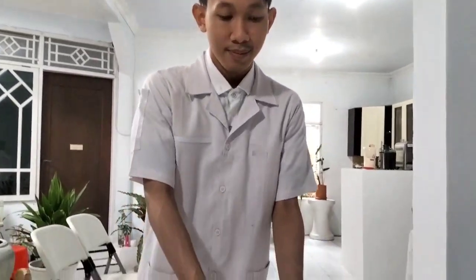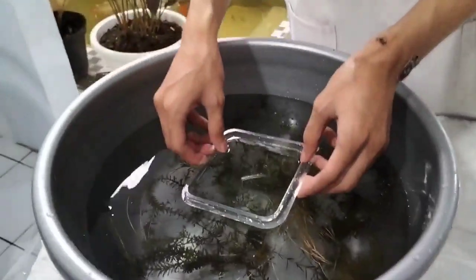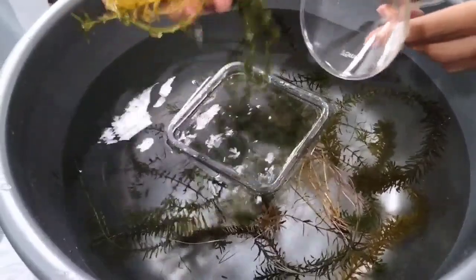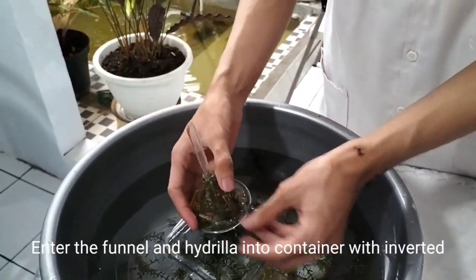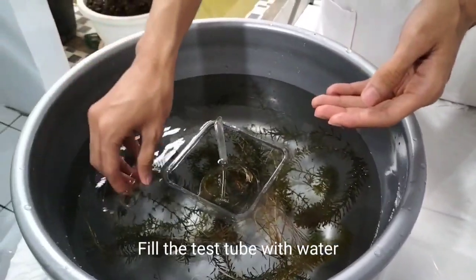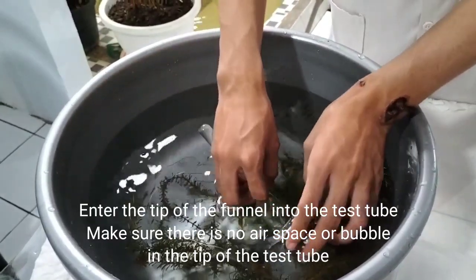Methods: First of all, fill the container with water. After that, prepare the plant — take a funnel and put the Hydrilla in the funnel. Then enter the funnel and the Hydrilla into the container inverted. Next, fill the test tube with water. Enter the tip of the funnel into the test tube, making sure there is no air space or bubble in the tip of the test tube.